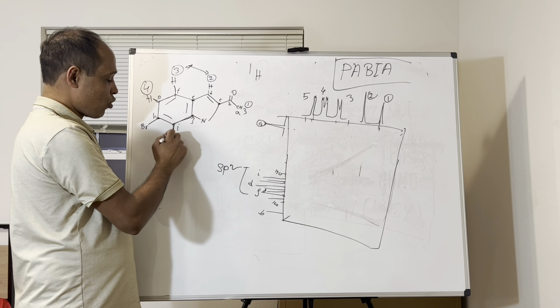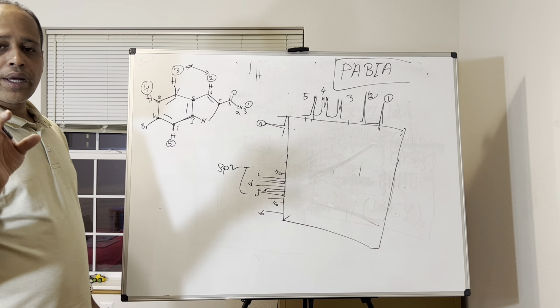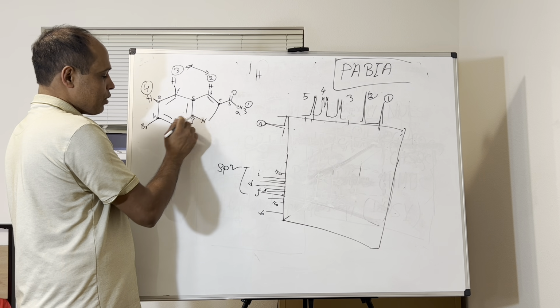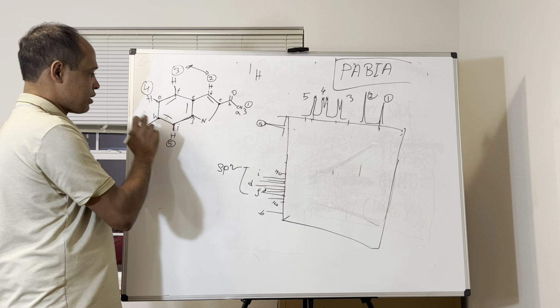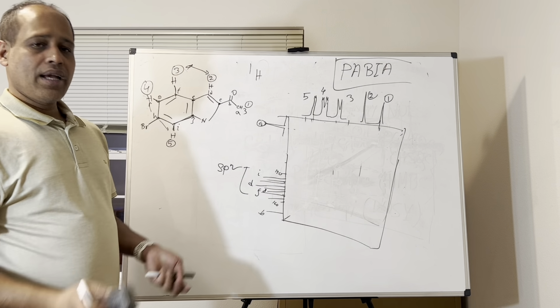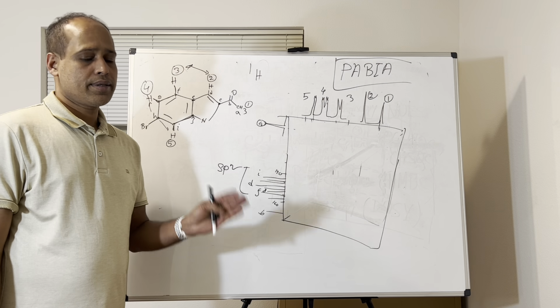This proton will give you a 2 bond away or 3 bond away cross peak. So ultimately you can see the number 5 will give you the cross peak with J and cross peak with E and also H. So by checking that HMBC also with the HSQC, that's why people always do HSQC and HMBC together.